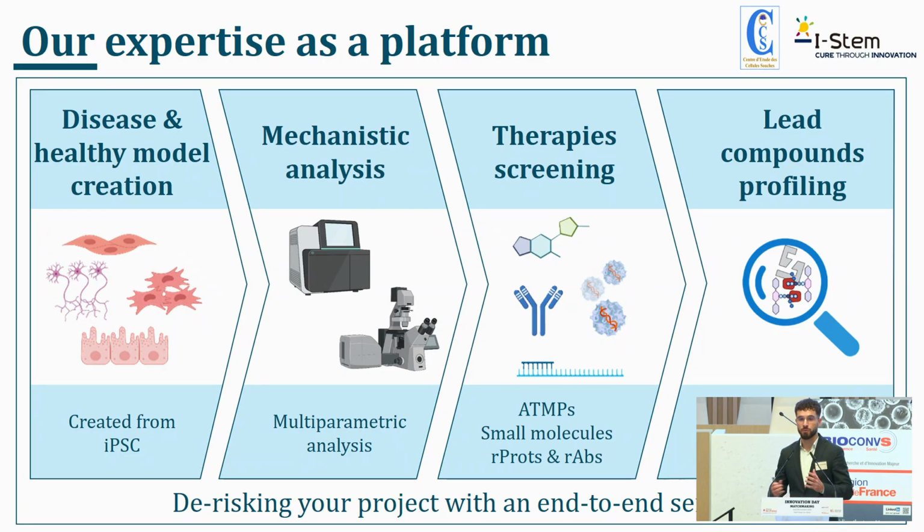And to support our research, we made a platform, and this gave us 4 packages that we can use on an individual basis or all together. Those packages are disease model creation, mechanistic analysis, therapeutic screening, and lead compound profiling. I will go through all those packages one by one.